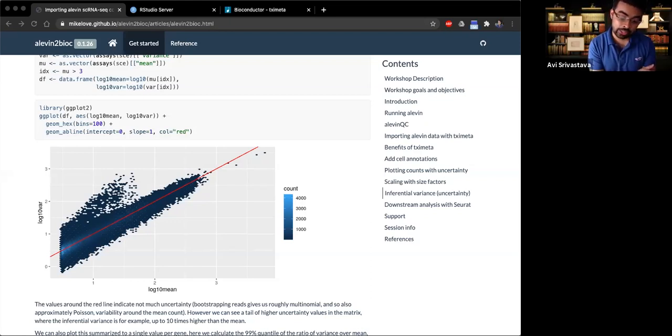And I would argue, in 3', I totally agree with Mike, if you have, say, a full length protocol, you can. But in single cell 3' sequencing, I would argue there is not much signal to generate transcript level, or let's say allele level, counts per cell. It would be really noisy, and we might need better methods downstream to actually process them, even in 3'. Uncertainty would be too high at the isoform level to generate the count, especially in 3' sequencing.